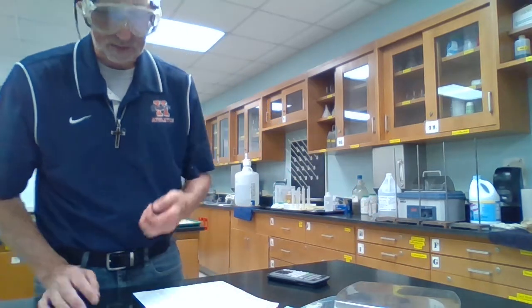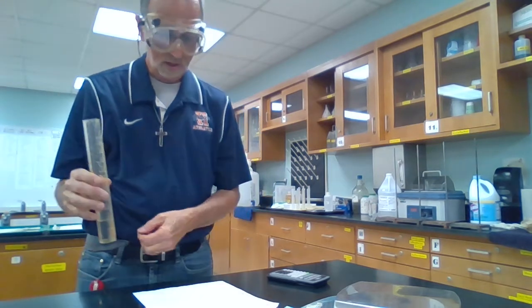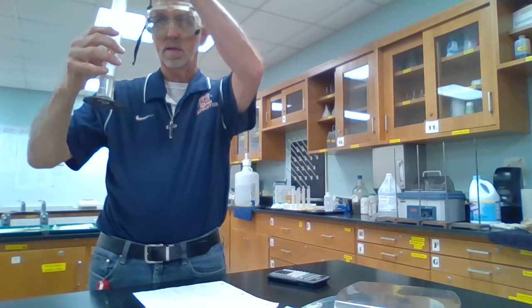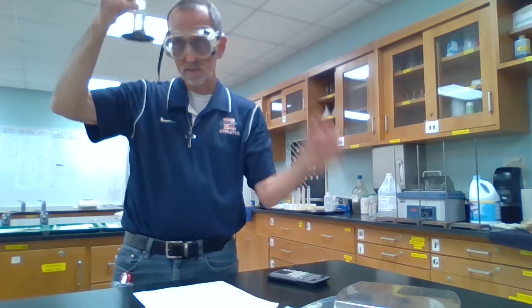So start with 1 penny. I'm starting right on 20.0. And once again, it's gone to 20.5. So the volume of 1 penny is 0.5 mLs. Get the second one in there. And it's gone up to 21. So 21.0 minus 20.0, 1.0 mLs for 2 pennies. So far, so good. 3 pennies.